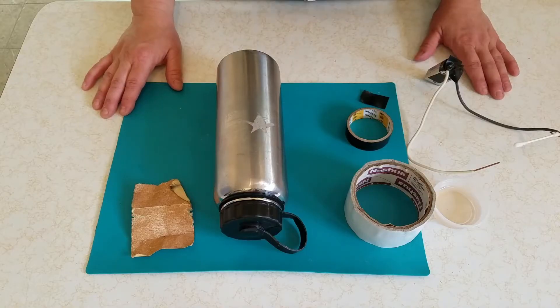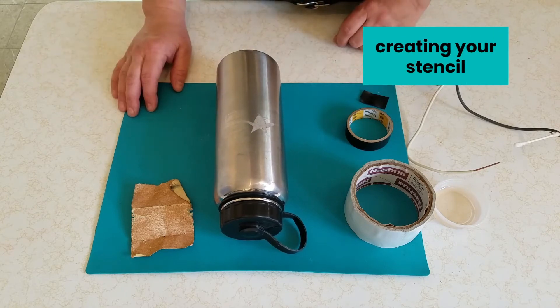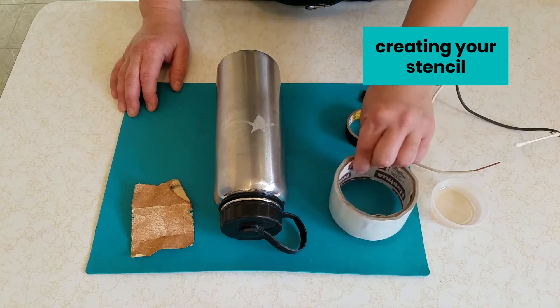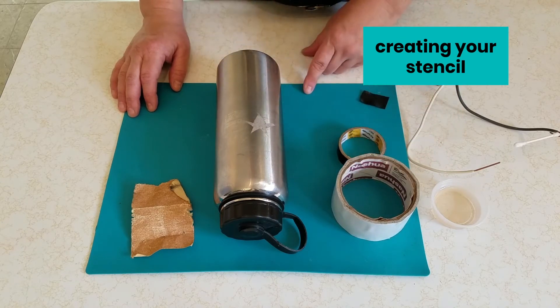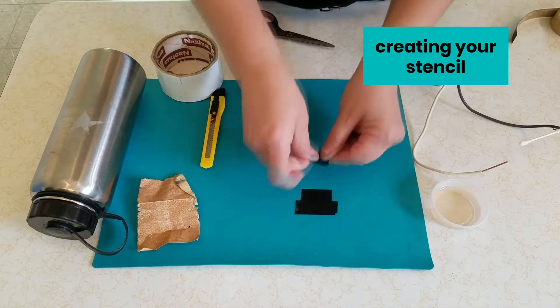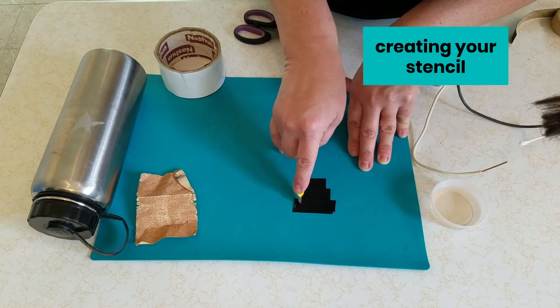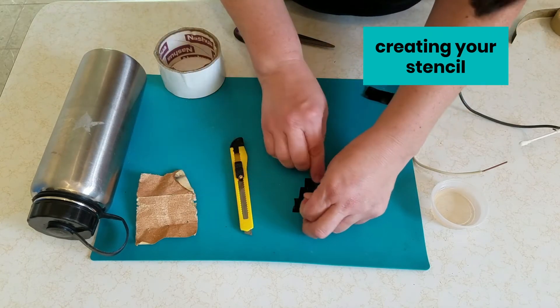The last step to get ready for our metal etching is to create a stencil for the shape that we want to etch onto our metal object. You can use any waterproof tape for this — duct tape or electrical tape. We're going to create layers of the tape on a cutting mat and then cut out the shape using an exacto knife. After that, we will lightly sand our metal object and transfer our stencil to the metal object. Then we'll be ready for plating.